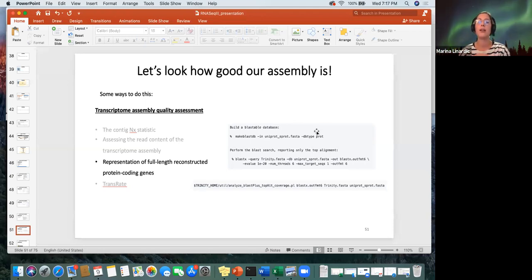This is not really done online because you cannot create your own databases, but here you can, and that's really, really useful. So practically how this works is that you download a database. In this case, it's the UniProt website. So protein sequences, this is the biggest protein sequence database available online.